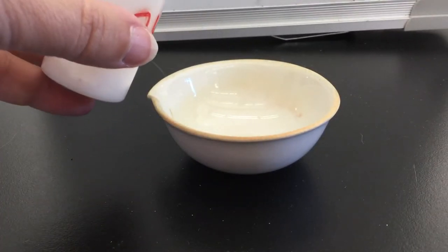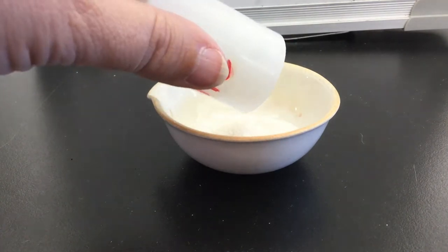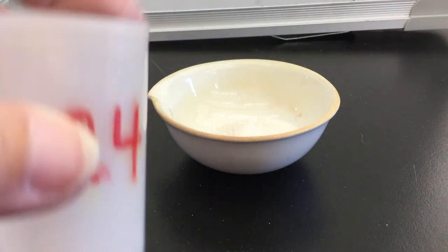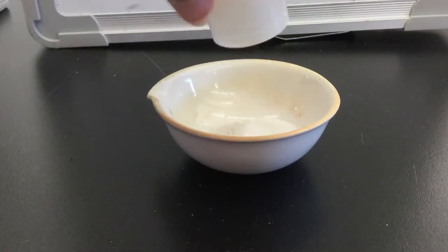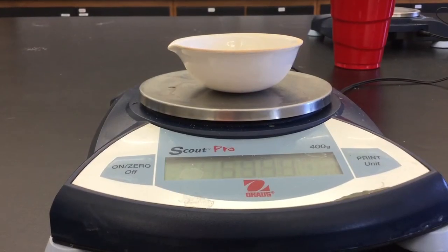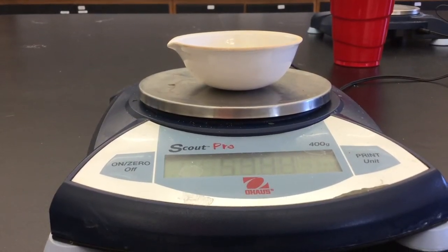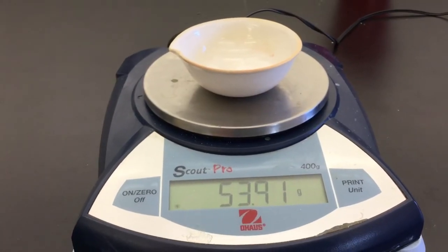Transfer the entire material from your film canister into the evaporating dish. You want to get all of it out. You may want to tap it on the counter and shake it a couple of times to be sure you have all of it transferred. Reweigh your sample and make sure that the number is steady, and record this number in your lab notebook or your data sheet.